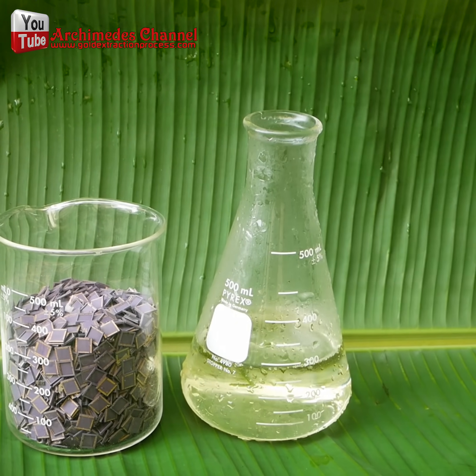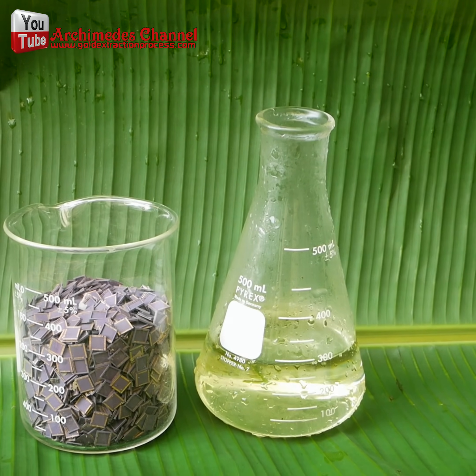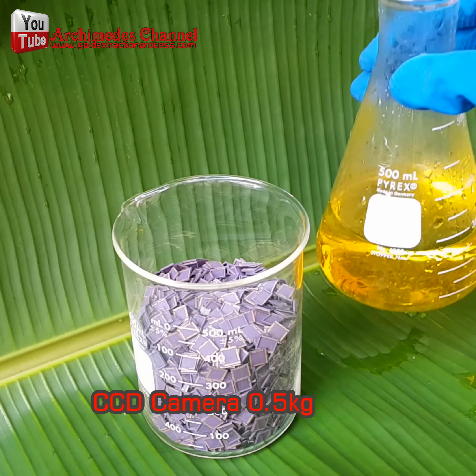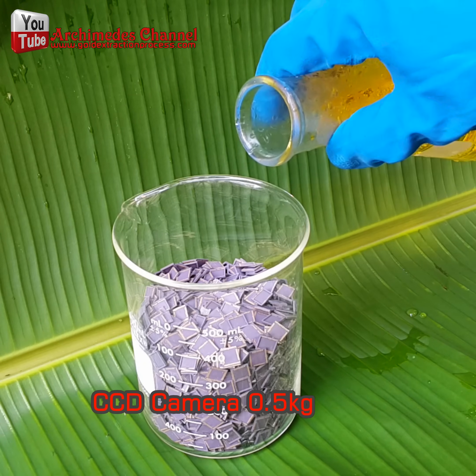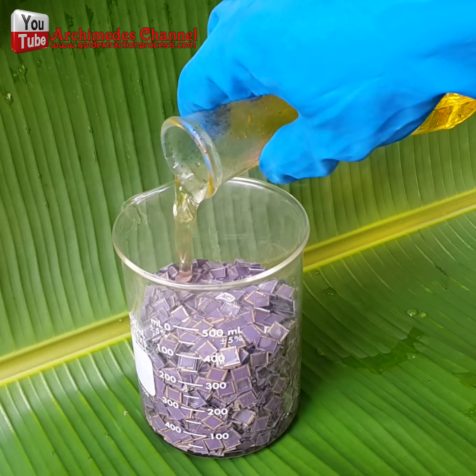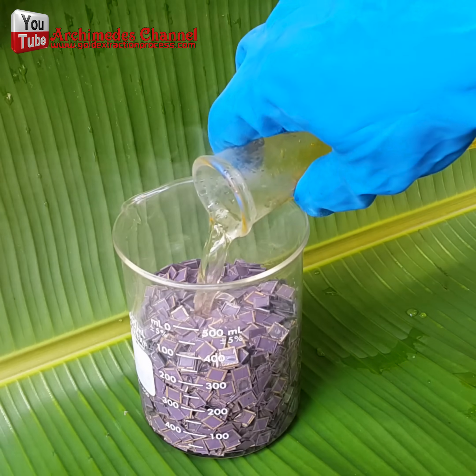I made aqua regia by mixing one part nitric acid with three parts of hydrochloric acid. I slowly poured the aqua regia onto the gold fragments, being careful to avoid any overflow caused by the chemical reaction.